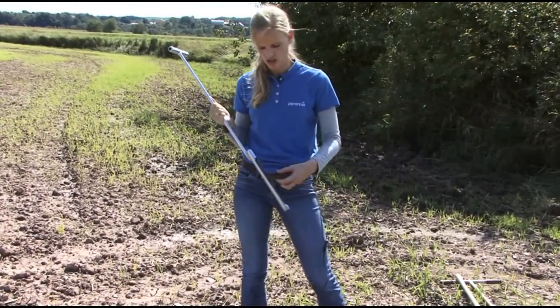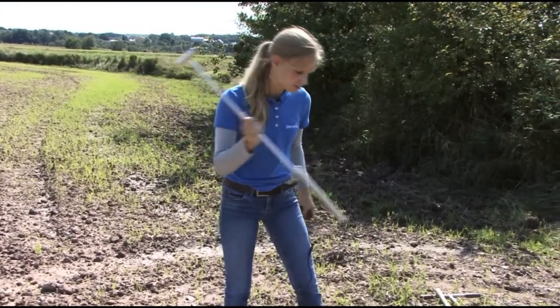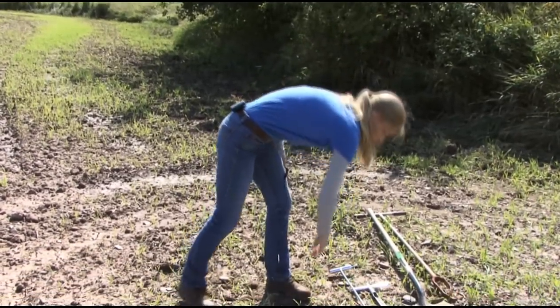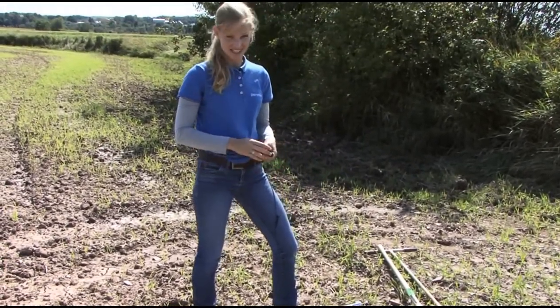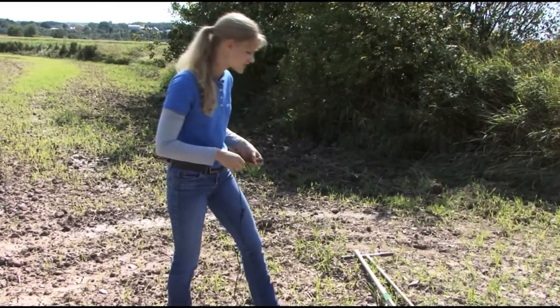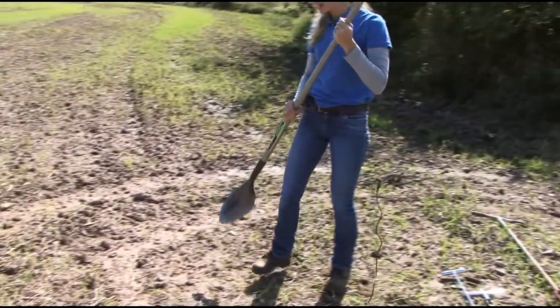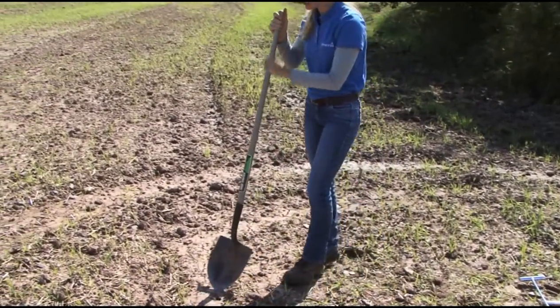Now, if you don't have one of these, and if you're not doing a lot of sampling, you can use a shovel. And everybody's got a shovel. To be honest with you, if you're not taking a lot of samples, I'd save yourself some cash. Some of these probes can run upwards of $100. And the shovel is just as effective, but there are a few cautionary things you need to keep an eye on.